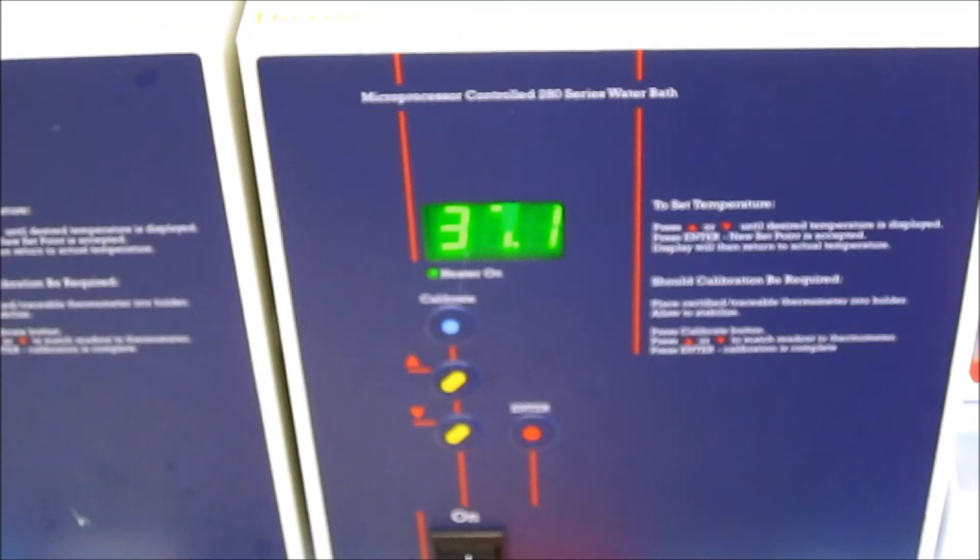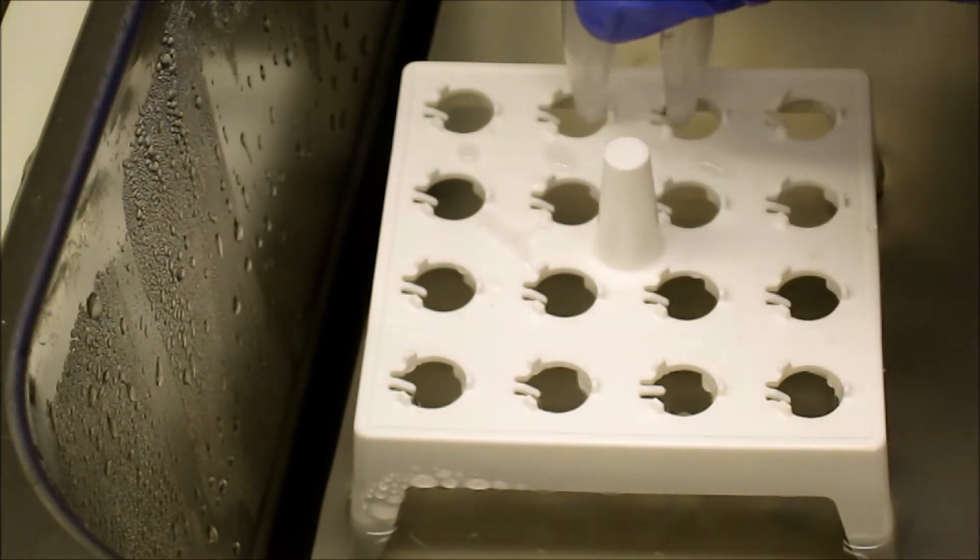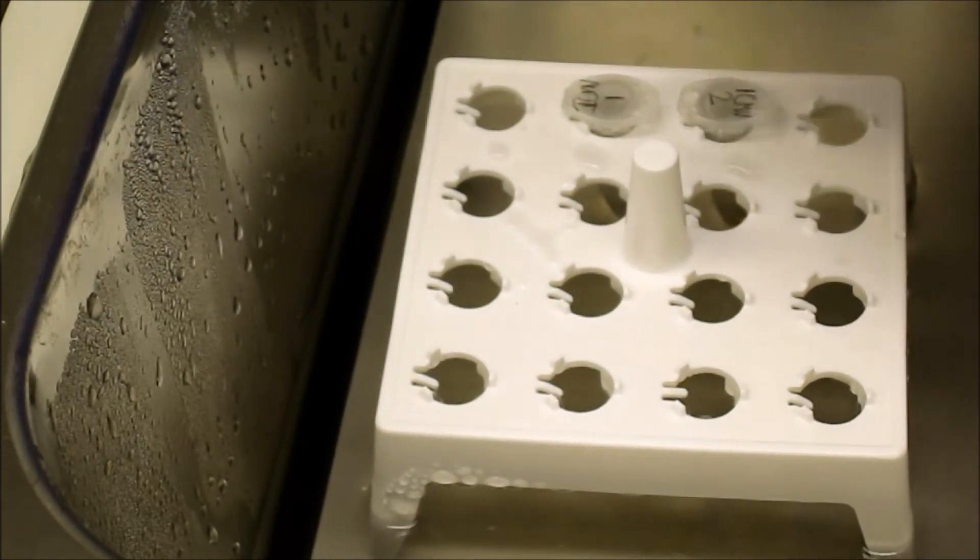Each sample is then incubated at 37 degrees Celsius for one hour to ensure that the fusion and cross-linking of the liposomes is fully carried out.